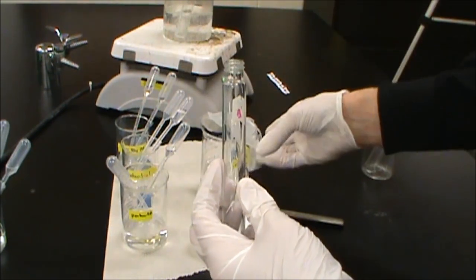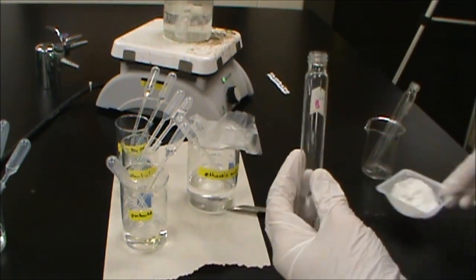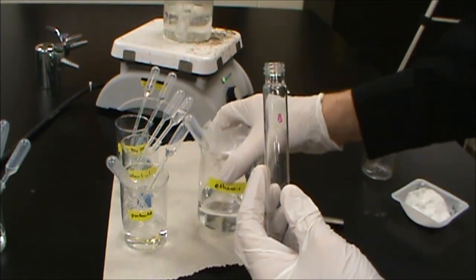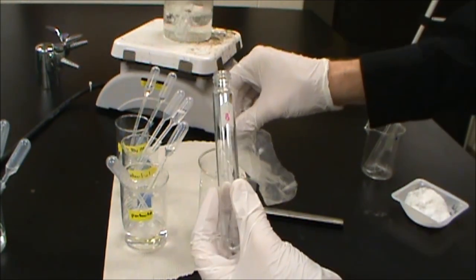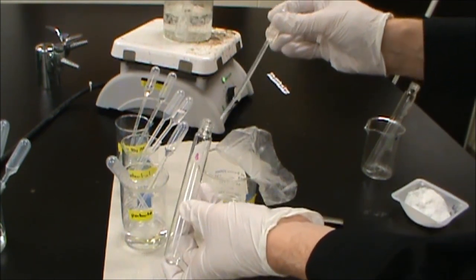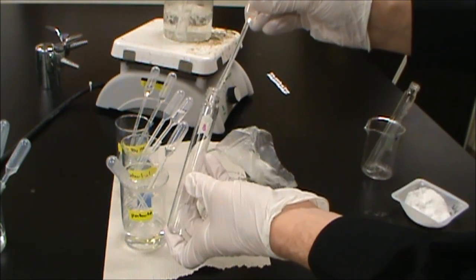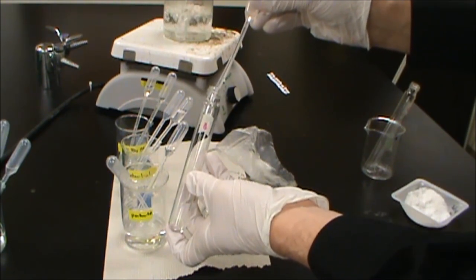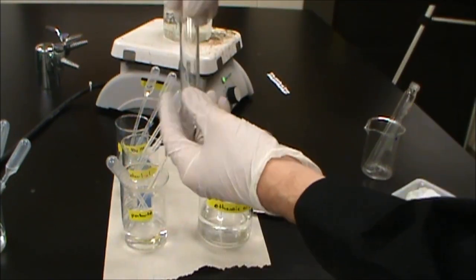And then we're going to add to that some ethanoic acid. So ethanoic acid, it's glacial acetic acid here. So this is pure, essentially, or close to pure. And so when you're doing that, you want to keep it covered when you're not using it. Otherwise, it'll smell pretty bad. So again, 20 drops of this. Okay, so now we have 20 drops of each in there.